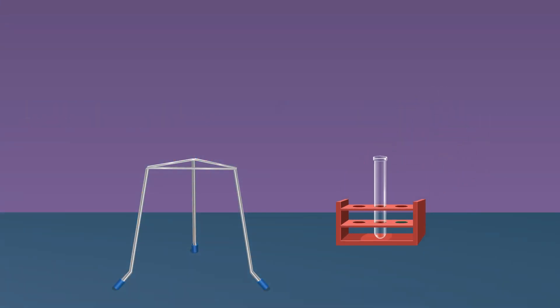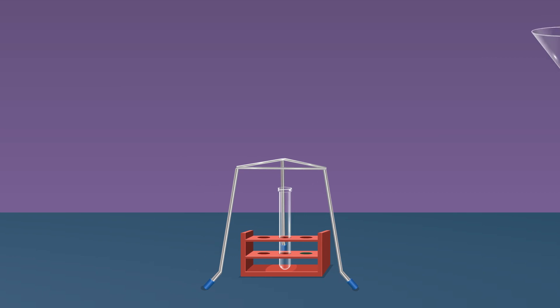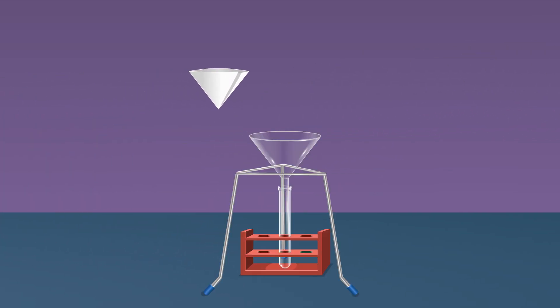Place a boiling tube below the tripod stand and then place a funnel in the tripod stand. Take the filter paper and fold the filter paper as shown and place it inside the funnel. Filter the content in the boiling tube using the filter paper.